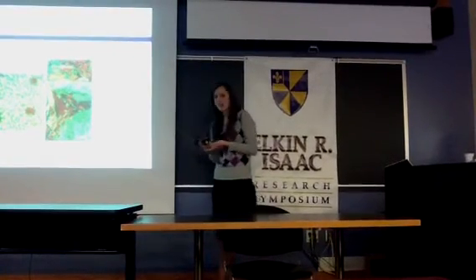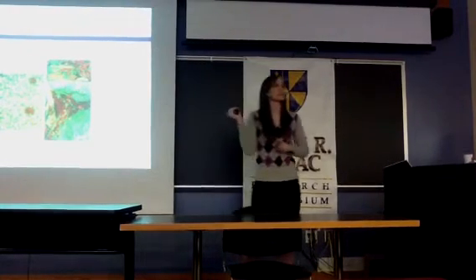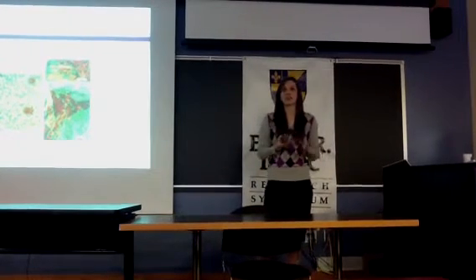Okay, so this data is suggesting that it is possible that Wolbachia can occupy the extracellular space. And this is actually a really surprising finding because this hasn't been observed in the Drosophila central brain before.